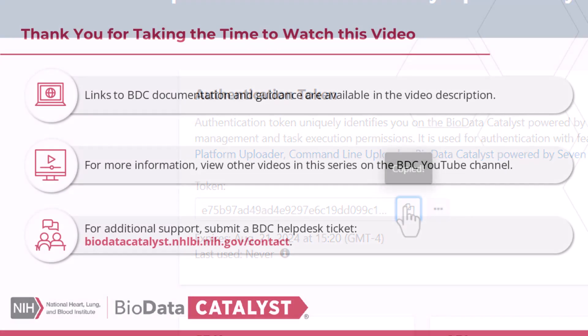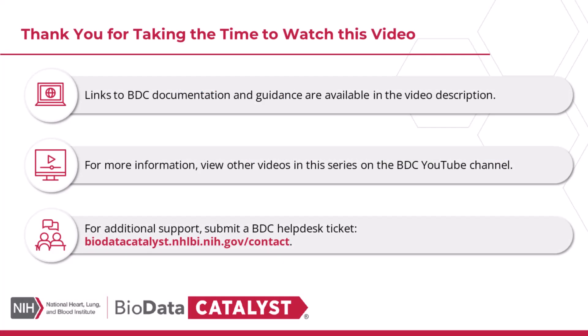This concludes the tutorial on setting up a BDC account. Thank you for taking the time to watch this video. You should now know how to set up and configure the command line interface for BDC.